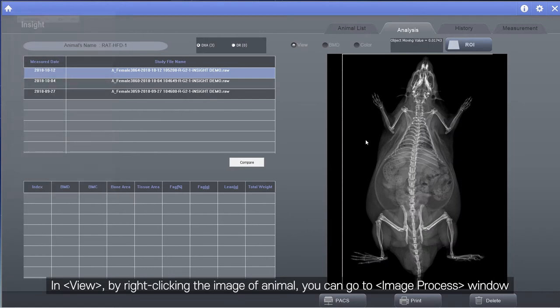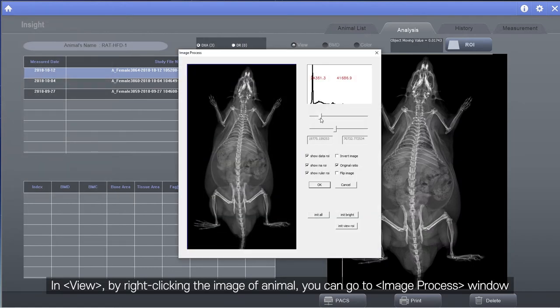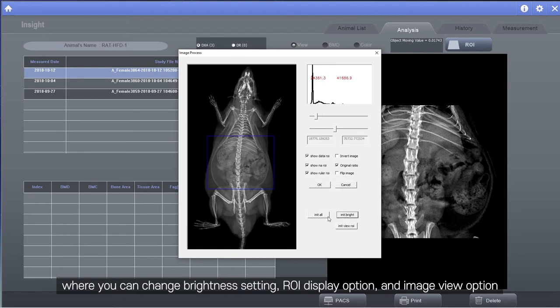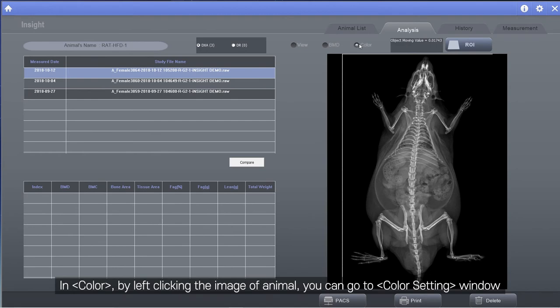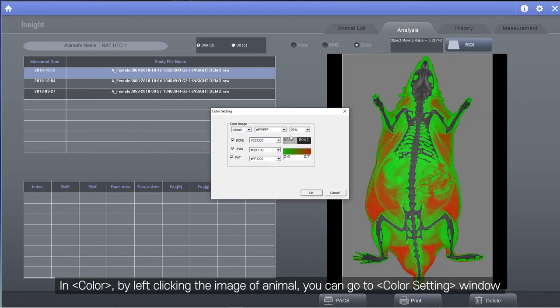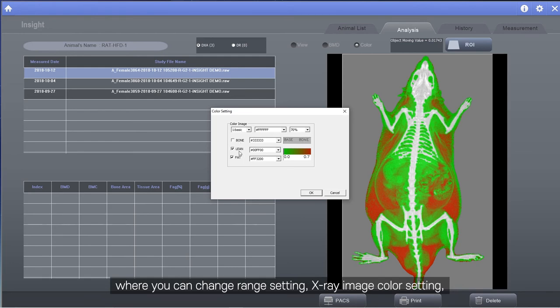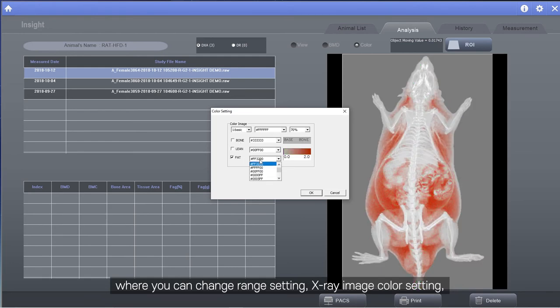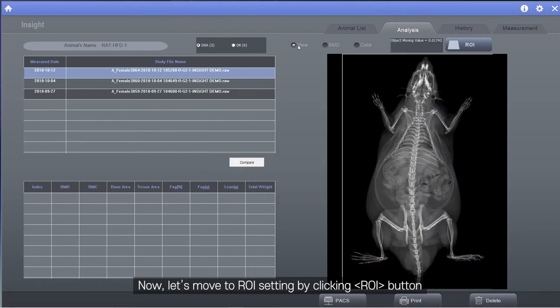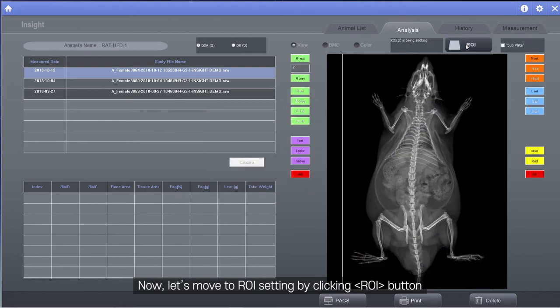In View, by right-clicking the image of animal, you can go to Image Process window where you can change brightness setting, ROI display option, and image view option. In Color, by left-clicking the image of animal, you can go to Color Setting window where you can change range setting, X-ray image color setting, color image transparency setting, composition color setting, etc. Now, let's move to ROI setting by clicking ROI button.